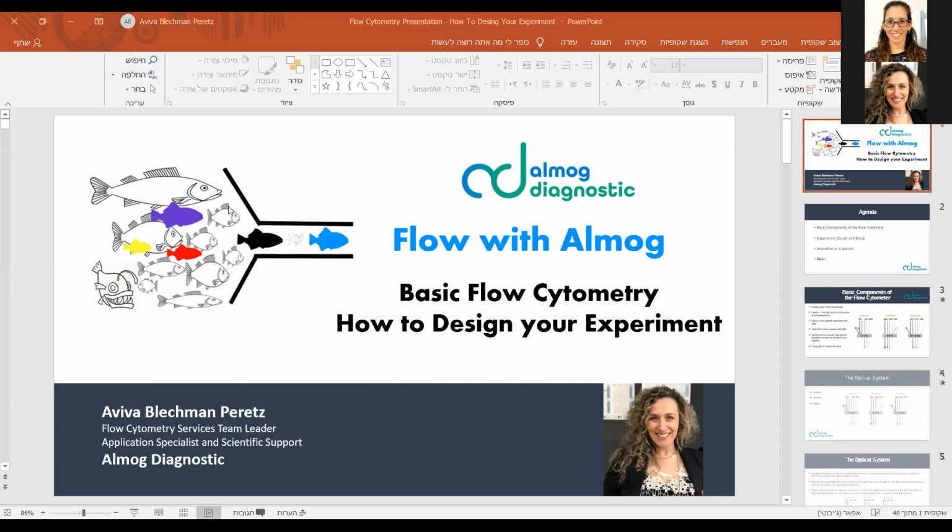But it can happen that, let's say, PE is excited by the blue laser and its detector is under the blue laser, but PE can also be excited by the red laser. So you can see a small portion of PE also in the APC channel. So yes, there are dyes that get excited also by different lasers, and you need to address it.